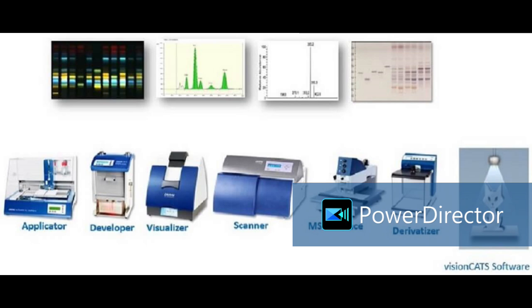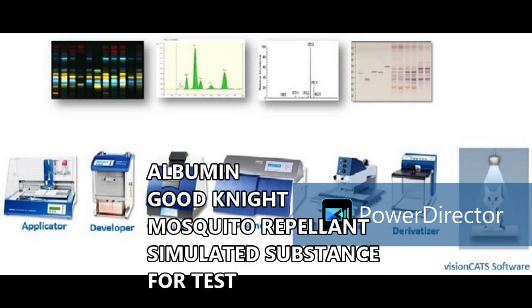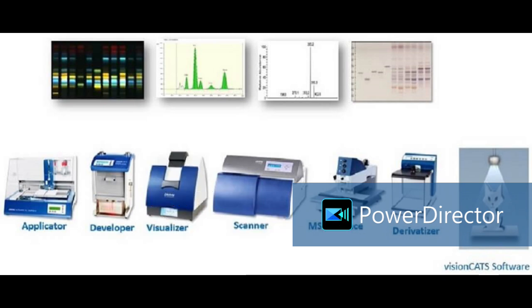She will be there with us for a practical demo. She is preparing samples and keeping things ready. Yesterday also we took one trial. We simulated one example. We took the albumin part of the egg, and in that albumin we spiked some amount of transfluthrin, which is a locally available mosquito repellent. We will show you a demonstration of how it separates, and how in the albumin sample we can detect transfluthrin.